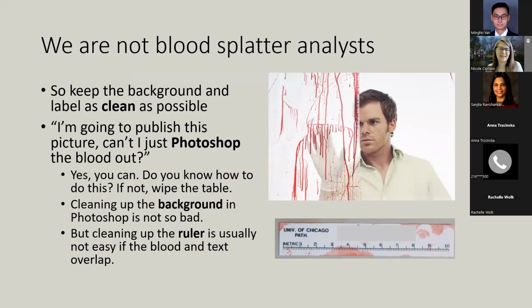And you're going to say, well, can't I just Photoshop the blood out? Absolutely. You can always do image manipulation. So you're going to say, ha, I can do whatever I want. Yes, of course you can do whatever you want. If you're not great at Photoshop, or if you don't know how to modify these images, try to keep them as clean as possible. Cleaning up the ruler, I would argue, is much more challenging than cleaning up the background, because the background is a space that you can crop out. The ruler has these tines that you can't really modify.